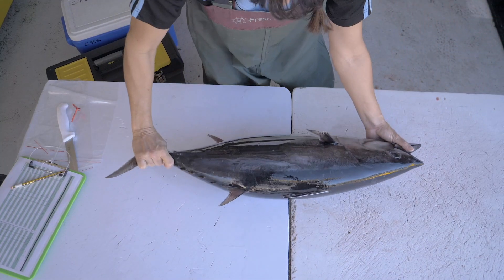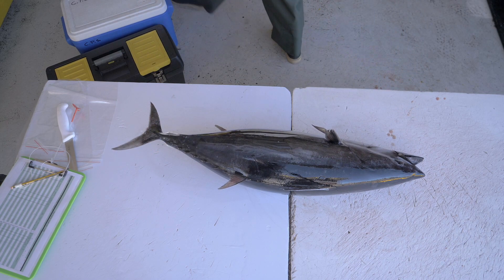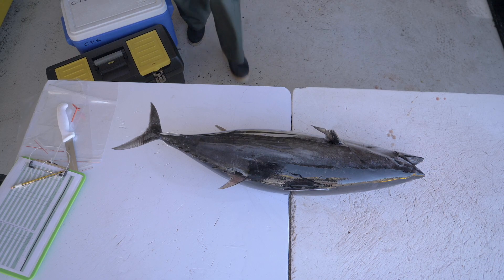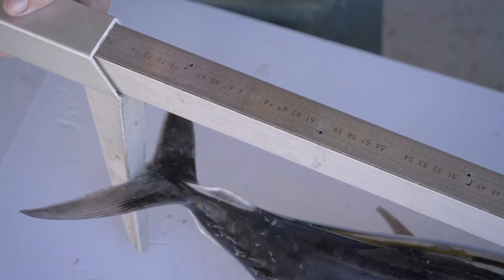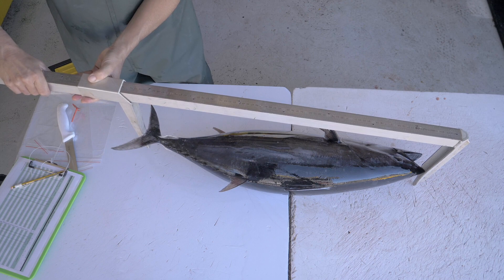I'm going to show you how to extract the internal organs of the tuna. Before sampling a whole fish, you always measure the fish using a caliper or any other measuring instrument. Here I'm using a caliper. I place the top of the caliper against the snout of the fish and slide the caliper towards the fork of the fish. We have a skipjack measuring 76 cm from the upper jaw to the fork length.